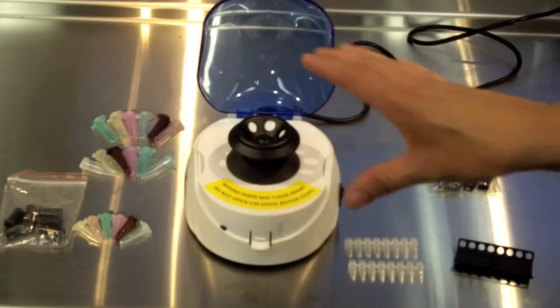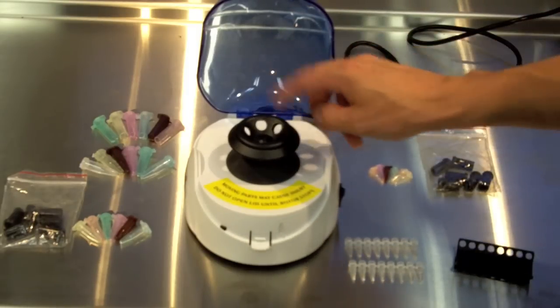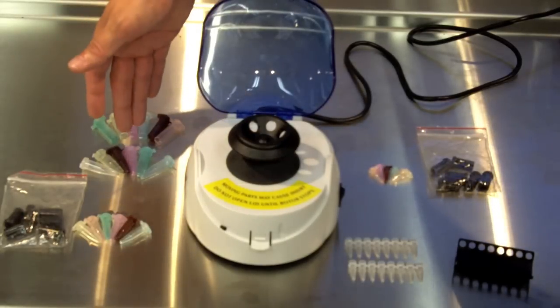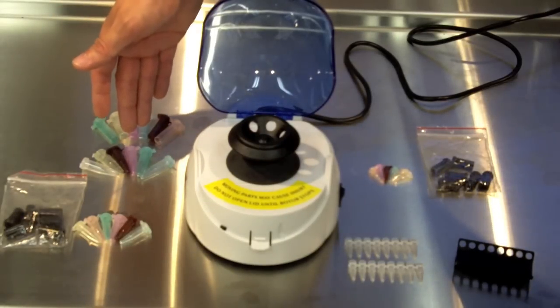So with the standard unit, you get the typical rotor to run 2 mil centrifuge tubes, as well as the 1.5 micro centrifuge tubes.